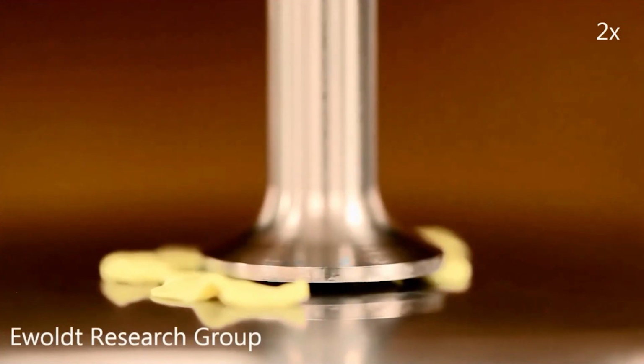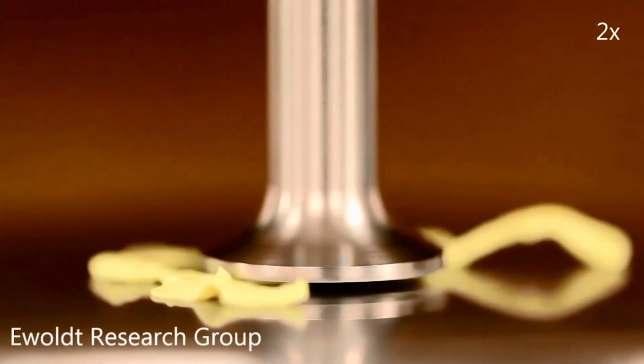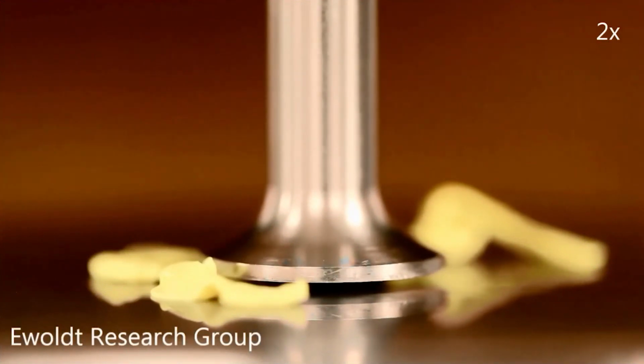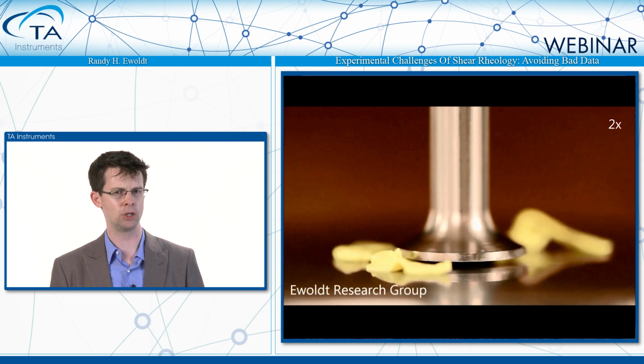Sometimes we see 3 arms, sometimes we see more. We and some other people sometimes call this an octopus effect, where these arms just magically seem to come out and flip around. There's a pretty dynamic one. So as you see this video, keep in mind that anytime you collect or you're seeing somebody else's large amplitude oscillatory shear data, if you just see the data, you might want to ask them a little bit more to be sure that what you're seeing in the data is really real data.